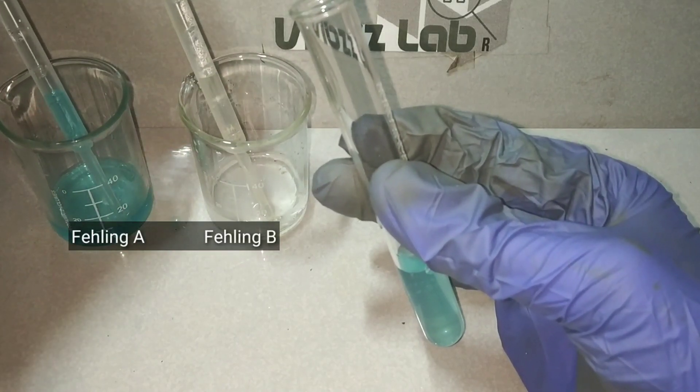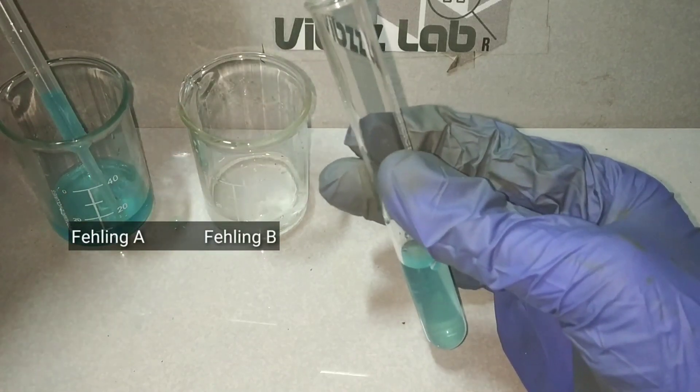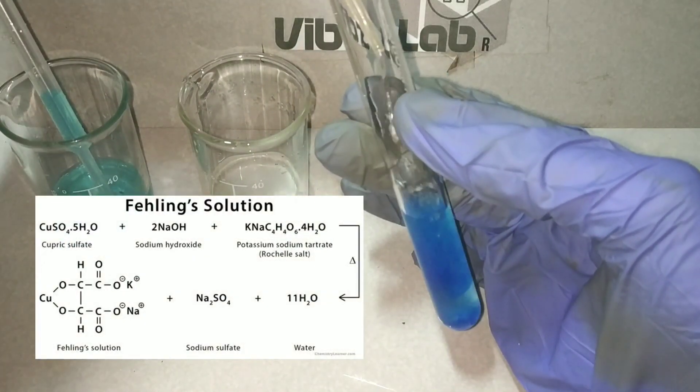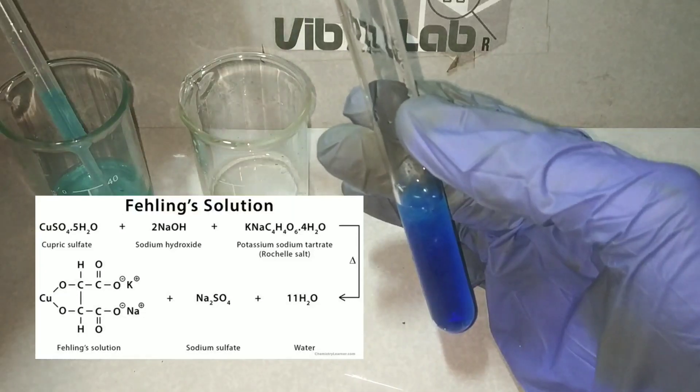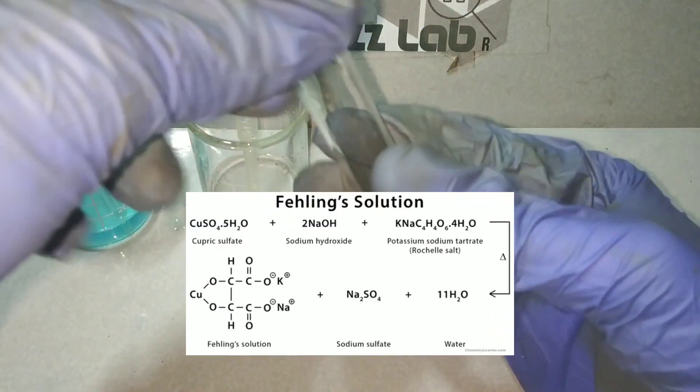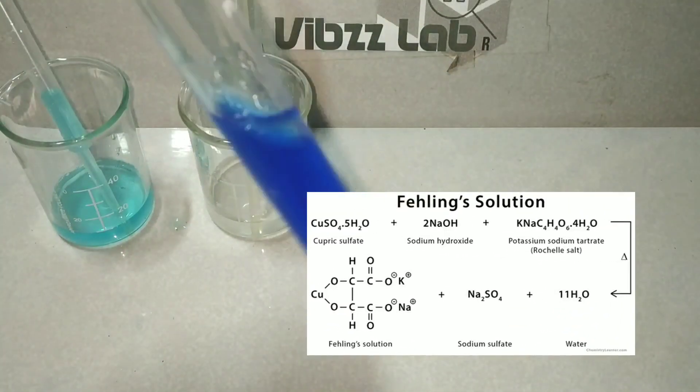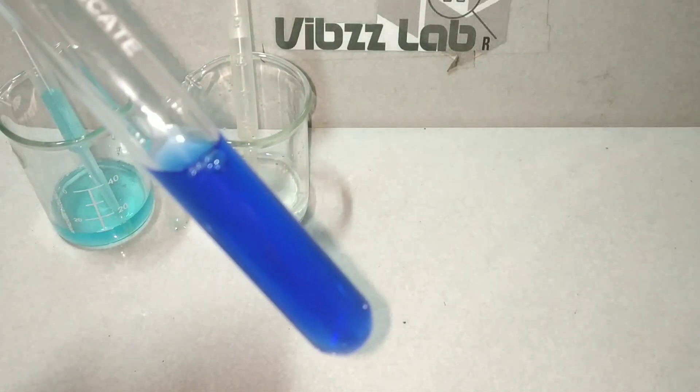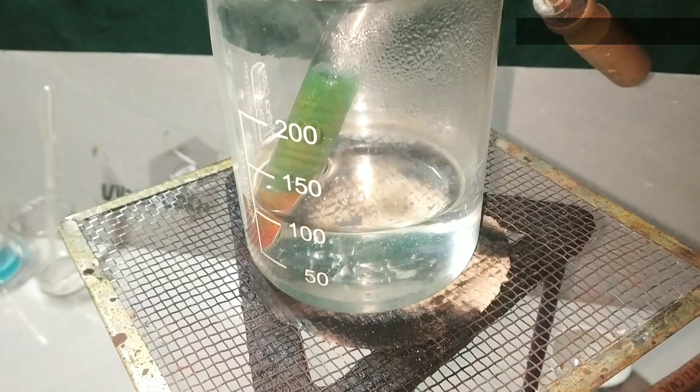Fehling reagent is formed when both the solutions A and B are mixed. We cannot pre-mix and store this product as it is not stable for a long time. The complex formed is a copper chelate of sodium potassium tartrate called Bis-Tartarito-Cuprate-2. This is an oxidizing agent which has deep blue color.